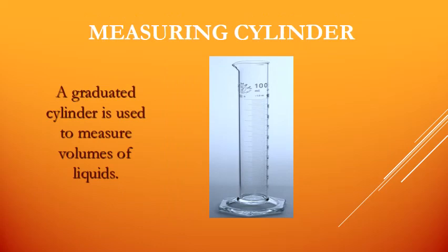Measuring cylinder. A measuring cylinder is a graduated cylinder, and it's used to measure the volume of liquids. Measuring cylinders also come in different sizes, and you can measure the volume of the liquid and transfer it to the vessel in which the reaction is being carried out. Sometimes measuring cylinders are also made up of plastics. You will draw this measuring cylinder also in your copy, and the flat bottom flask also.